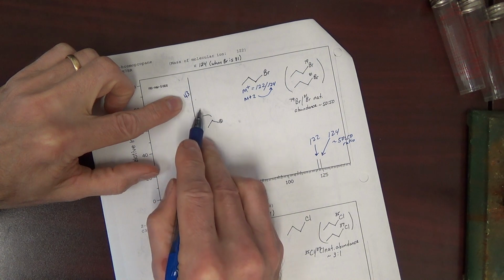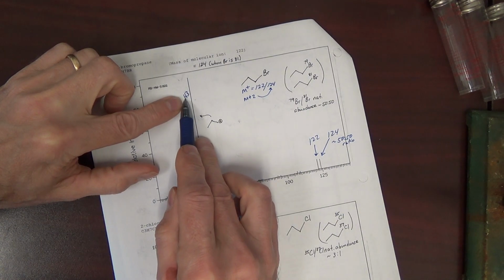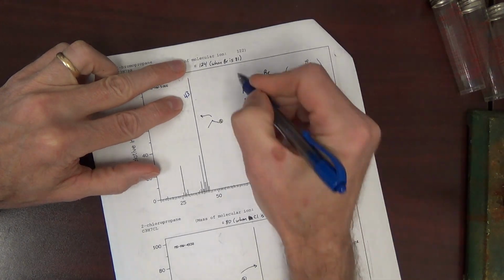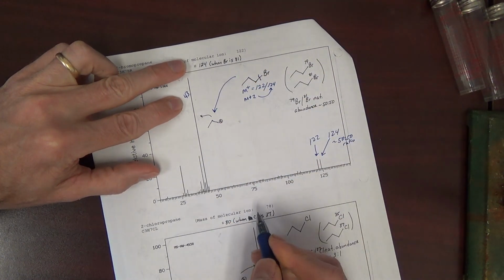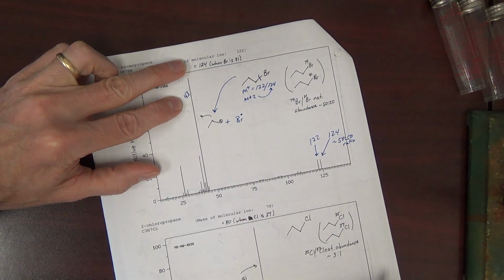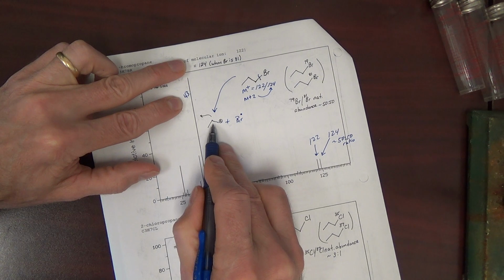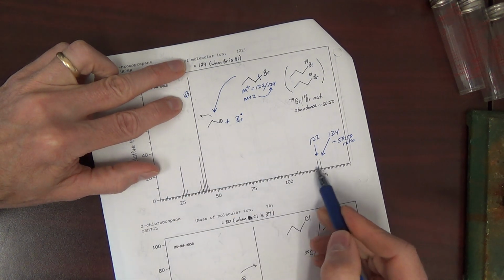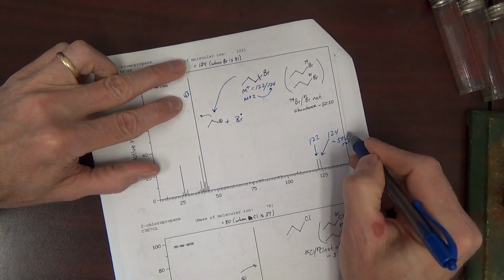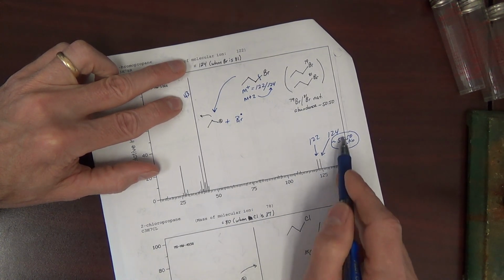Peak at 43, obviously this cannot contain bromine, because bromine is 79 or 81, so bromine must not be present. 43 comes from cleaving off the bromine here and getting this cation plus the bromine radical. Now, there's no bromine here, so we do not expect to see the isotope pattern that we saw with the molecular ion. And by the way, the 50-50 ratio is the isotope pattern of a monobrominated compound.